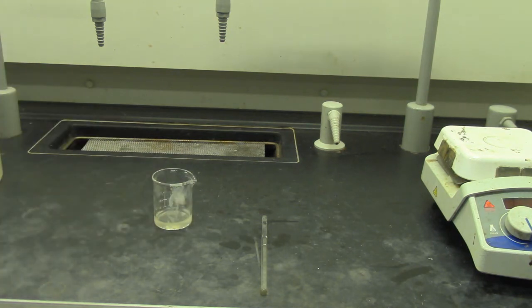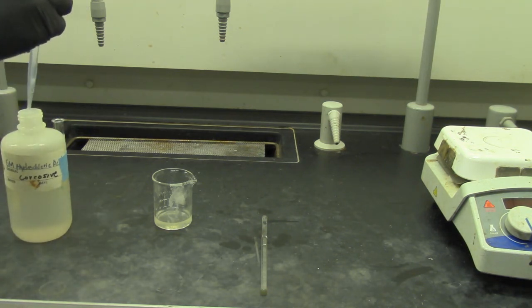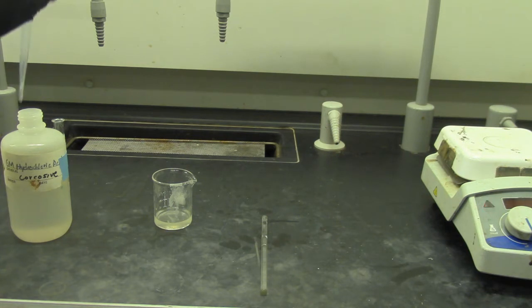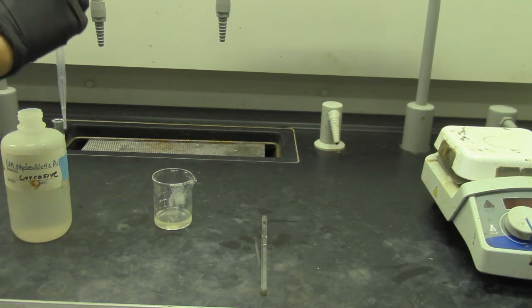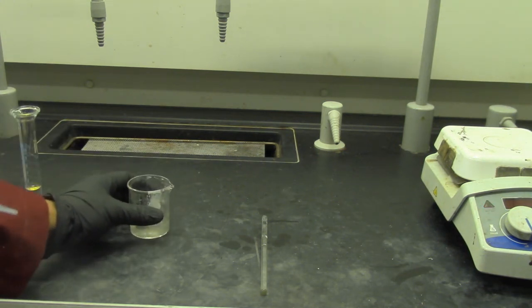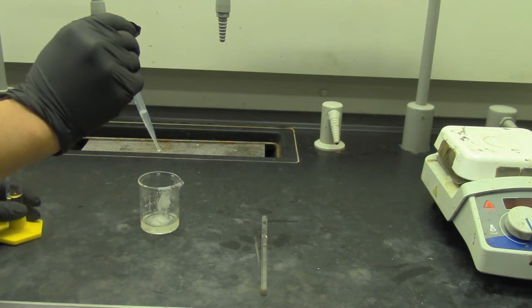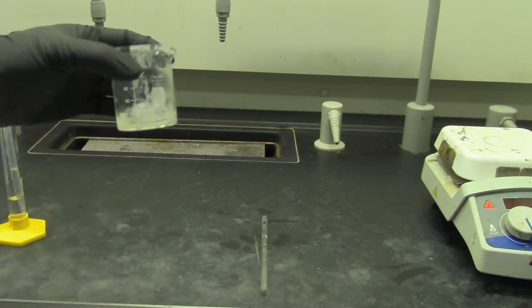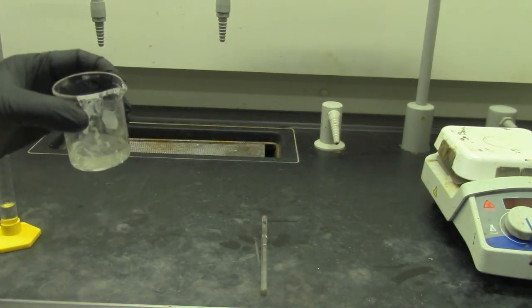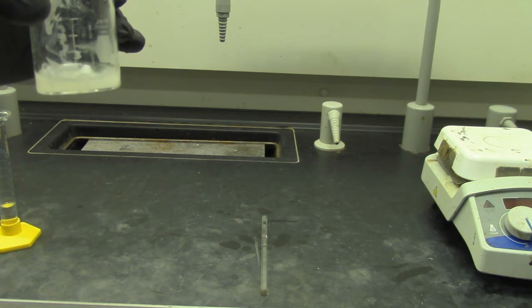It's cool enough. And I'm going to add 5 ml of 6 molar hydrochloric acid, okay, to precipitate out the benzoic acid. About 5 ml is enough. Okay. Add this to this solution. I'm going to add slowly so you can see this. Bring it to the camera. Yeah, you can see.